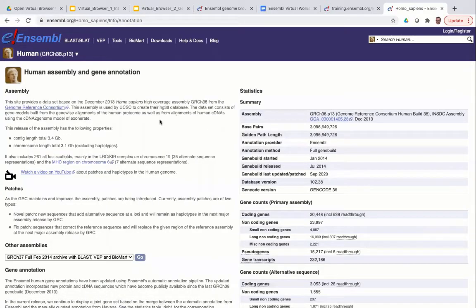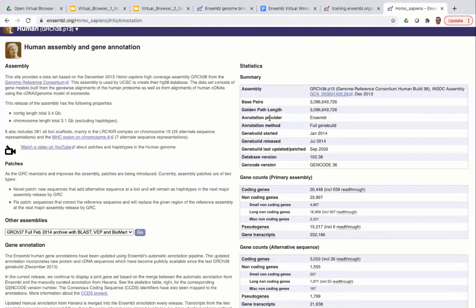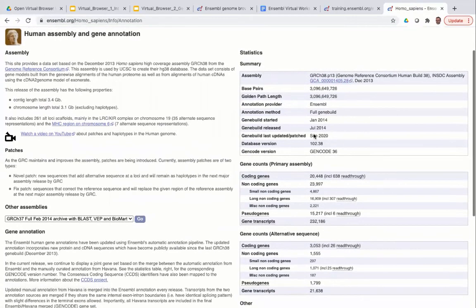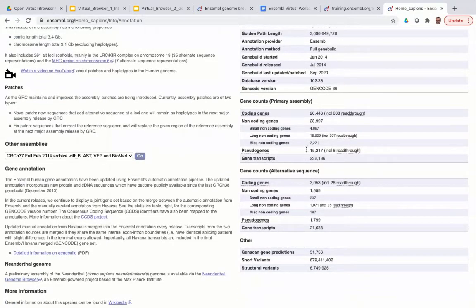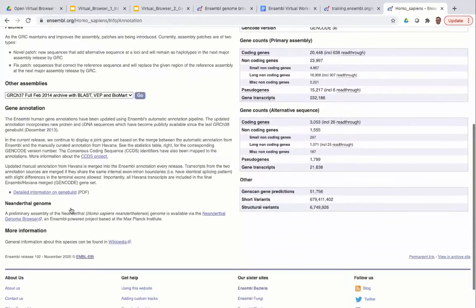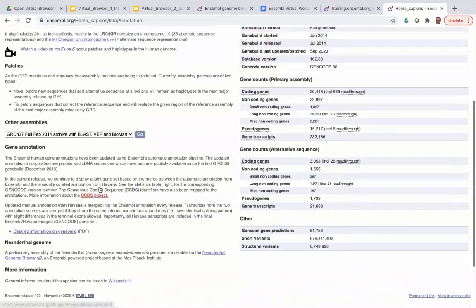The final thing to show you is the 'more information and statistics' link. If you click here, you'll find information about the genome assembly — when it was produced, its length, the number of annotated genes, coding genes, non-coding genes, and pseudogenes. There's also background information about the gene annotation process which you can read as well.